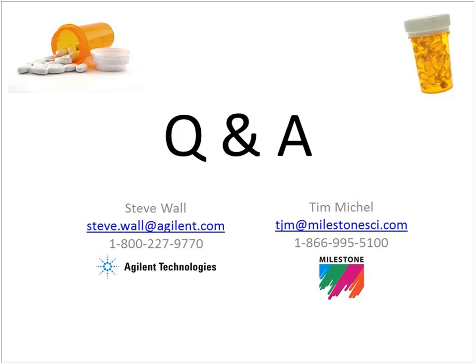I think most people understand that, but it's not really clear with the examples that are given in some of the documents that are out there. And along those lines, there were a couple of requests for the J value calculator. Is that available at the Agilent site? It's not actually on the Agilent site, but please feel free to send an email. My contact information is on the screen, and I can email you that interactive J value calculator.